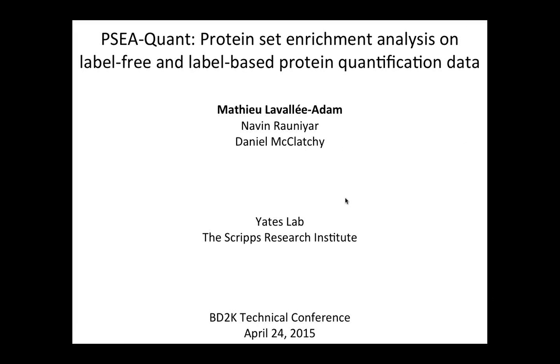Thank you very much, Vincent, for the introduction. So indeed, I'm going to talk about PSEA-Quant, a protein set enrichment tool that we felt in the Yates lab was becoming a necessity at some point in order to analyze the large proteomics data that we're producing.